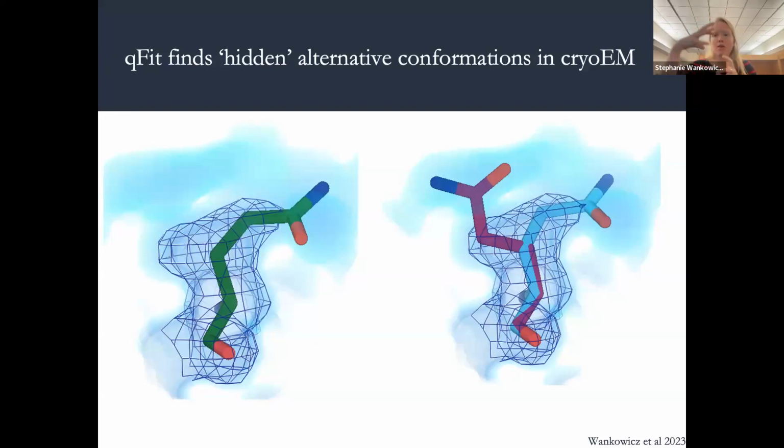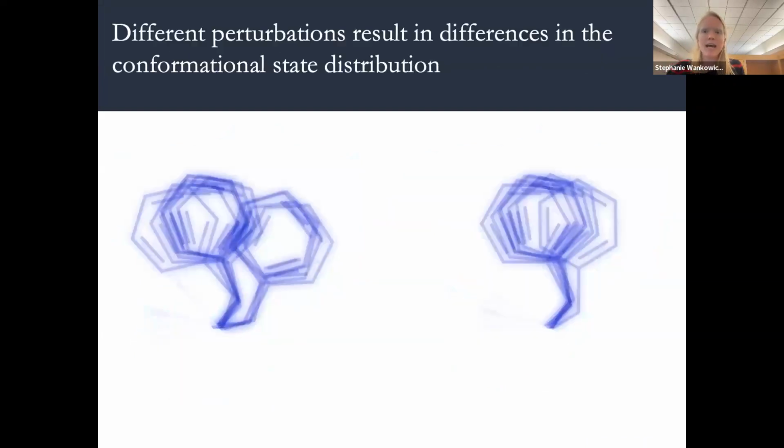And although there are many other ways that we can model in larger conformational ensembles, it's very, very important to also pay attention to these very delicate sidechain and backbone conformations. And we're really excited for the fact that in cryo-EM, we don't have what's called the phase problem in X-ray crystallography, which is just a way that the map is adjusted based off of the model. And so we think that we can push this even more to look at structures that are at a resolution of 3-4 angstroms.